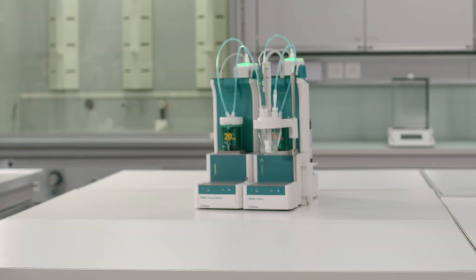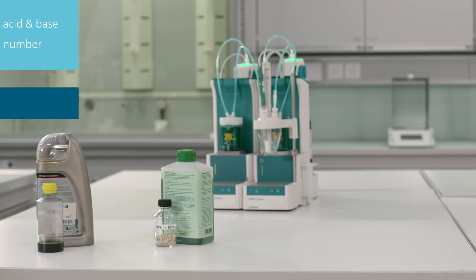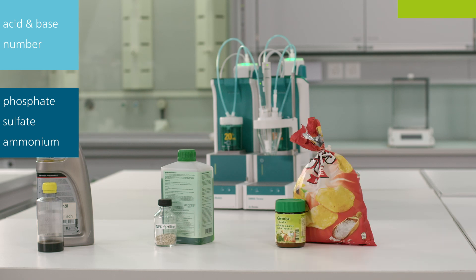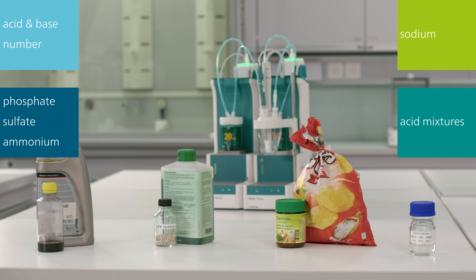Typically, thermometric titration is used to determine the acid number or base number, phosphate, sulfate or ammonium content in fertilizer, sodium content in various foodstuffs, or for analyzing acid mixtures. All these titrations can be performed with the same sensor.